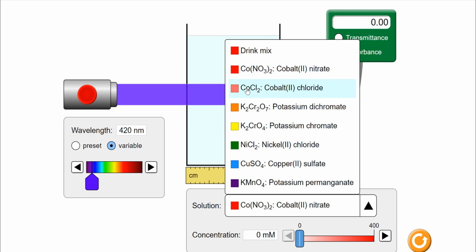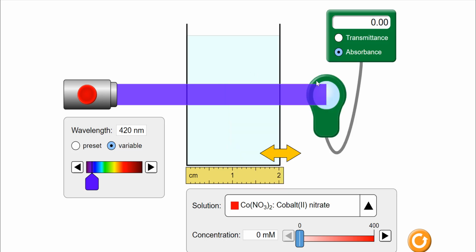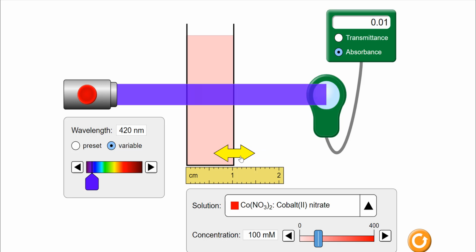So as we track our absorbance spectra, as we try to figure out the preset wavelength for these two solutions, I'm going to want to figure out whether the curves look similar or different, and why or why not. Okay? So I'm going to assume that you've done that. Again, I'm going to reiterate: part 1, I'm going to have a chemical here. We would have defaulted at 100 millimolar. We're going to start off with a path length of roughly 1 centimeter. For a fair test, I want to make sure I'm only changing one variable at a time.